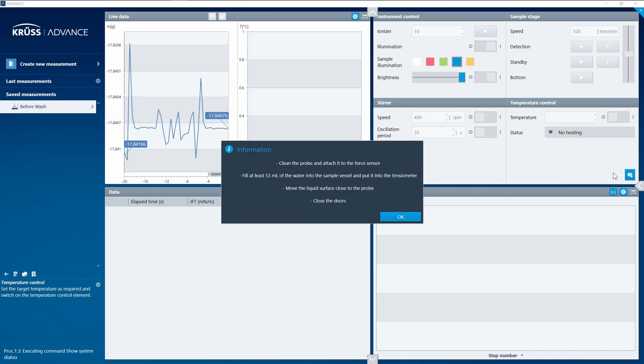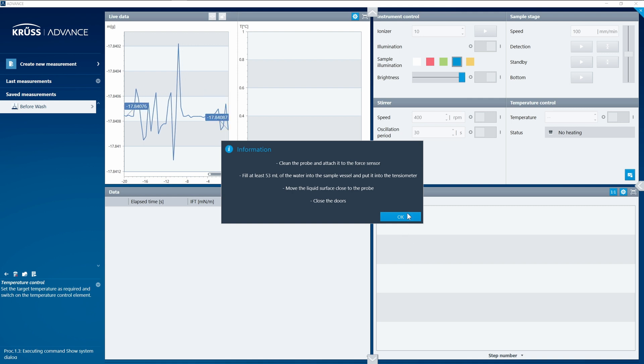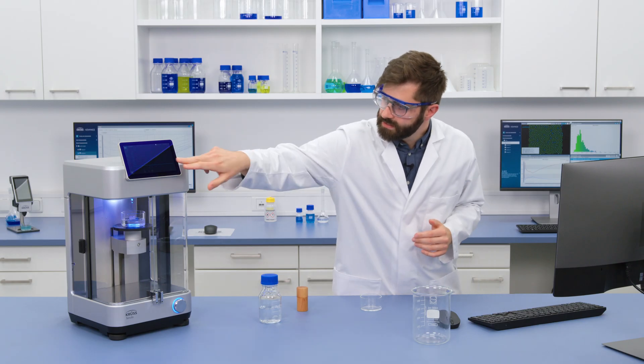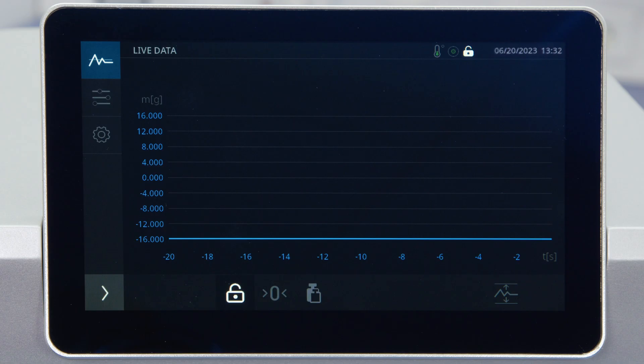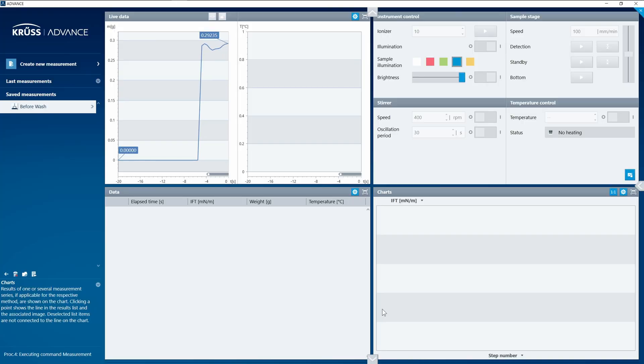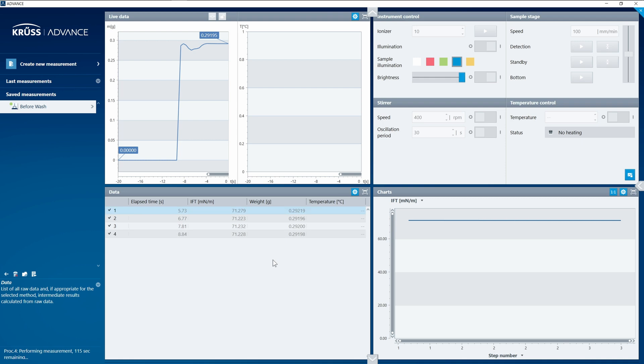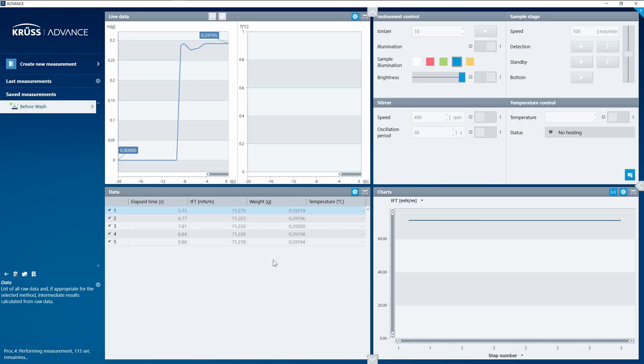ADVANCE runs through the predefined steps in my automation program: first it unlocks the force sensor, then it zeros so I have a fresh data set, and we can see on the live display the force sensor jumps to zero. Then it waits for stabilization to ensure there's no vibration in the area, and a beep tells me it's starting to measure. We can see in ADVANCE that results come in live — one, two, three, four, five — and they're plotted as individual results on the left and as a graph on the right.